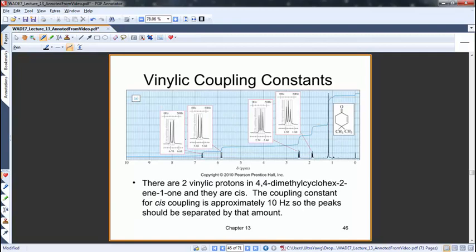We can go ahead and do all these. I'm not going to bother. You can look at them if you want, but the rest is just following this protocol, right? So I have a hydrogen here, the hydrogen here. These guys are all the same as each other. This is different. This is different. These two are different. These two are different. And hopefully you can figure that out, right?